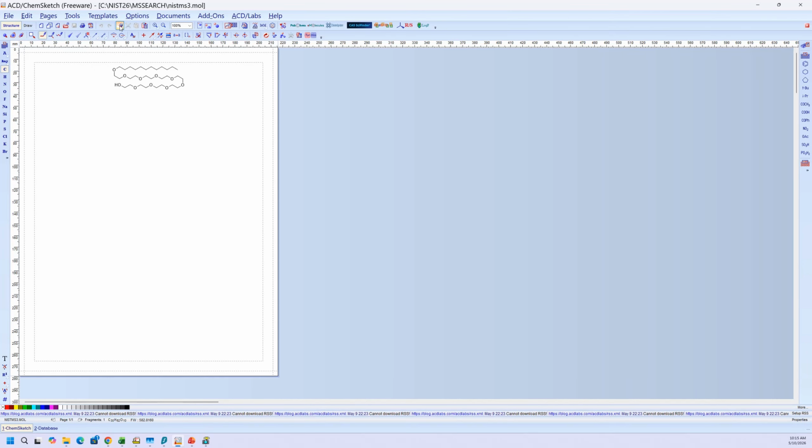So what we need to do is get rid of 3 ethylene oxide groups. We're at 582 here. So we get rid of this, 2, 3. And now we have the structure that we want, something that weighs 450. You can see at the bottom here. So you need to select this, especially if you had more than one structure in here. You need to select what you want to send because there could be multiple structures in this drawing program that you've been working on. So you say edit, copy, and that'll put it in the clipboard for you.